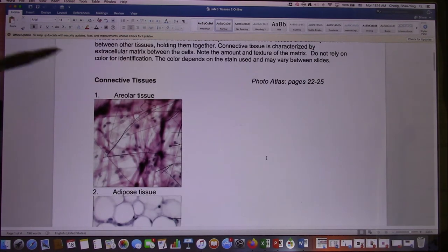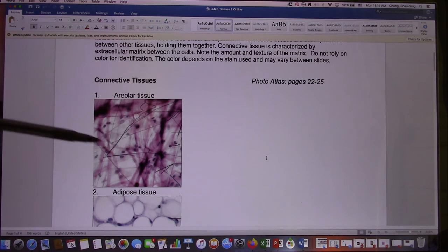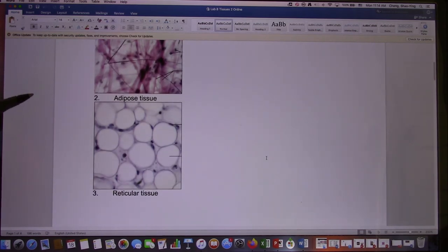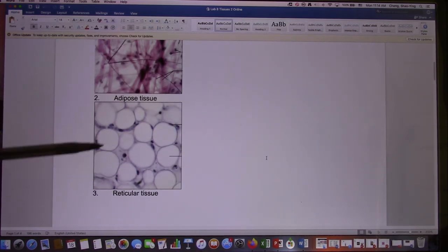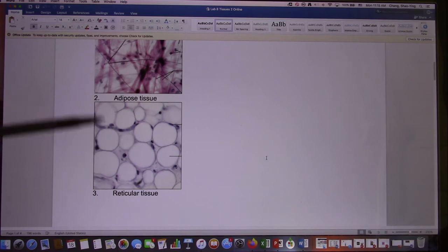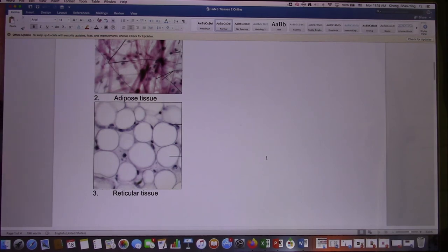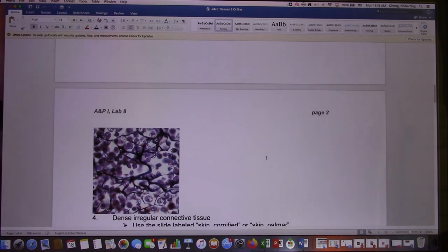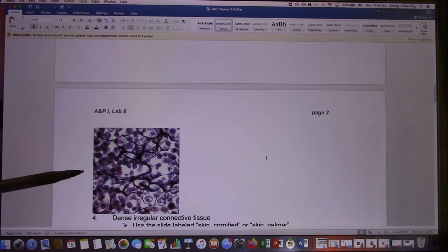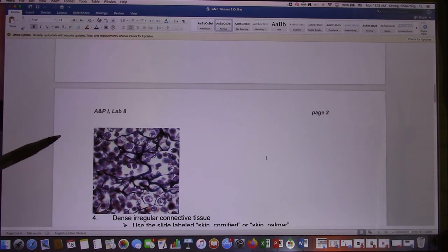The first one is areolar — a loose connective tissue. You find not too many fibers and these fibers are irregular. Next one is adipose — very easy to identify because they look like bubbles. The fat inside is washed out by alcohol so they have a lot of empty bubbles — that's adipose tissue. Next one is reticular, which looks like cherry blossoms. It's still a loose connective tissue and the answer will be reticular.